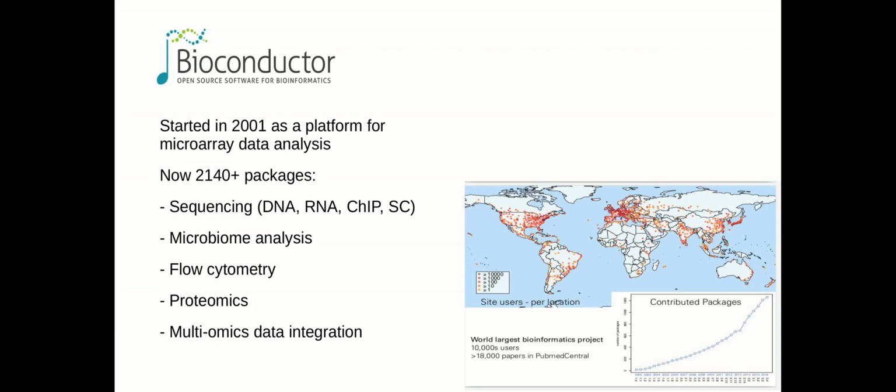These tools are typically interoperable so that we can utilize tools built by different communities as long as we rely on similar data representation standards. And this is one of the strengths of the Bioconductor ecosystem, that we are not only limited to the tools for analysis and visualization built by our own community, for instance microbiome researchers, but we can also utilize tools from other fields such as single-cell sequencing, which is using very similar techniques to what we do in microbiome research in the context of R and Bioconductor analysis.